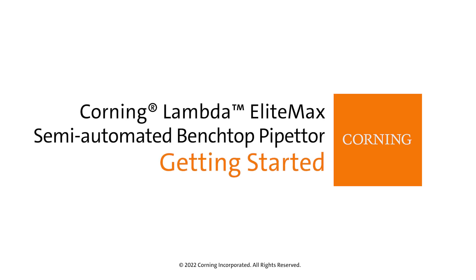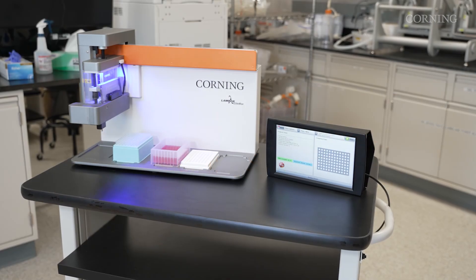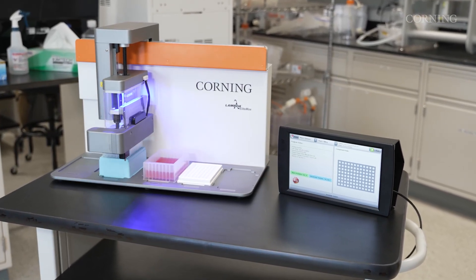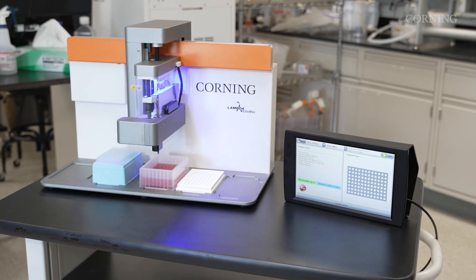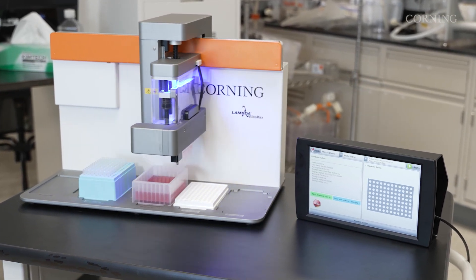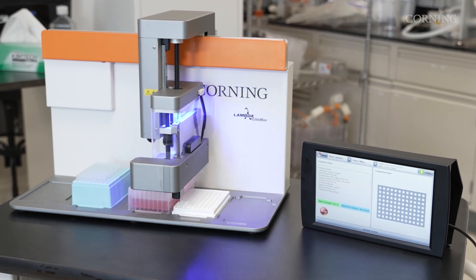Getting started. Introducing the new Corning Lambda Elite Max Semi-Automated Benchtop Pipetter, an easy-to-use liquid handler that is not only an affordable addition to your lab, but one that can perform a wide range of protocols.